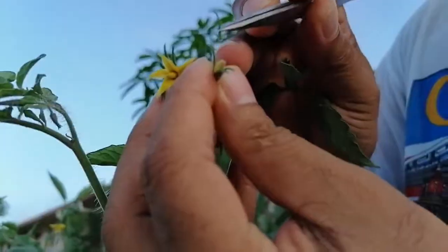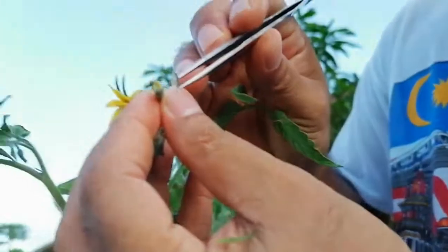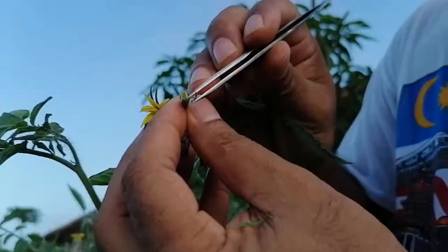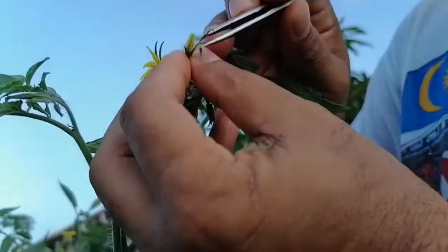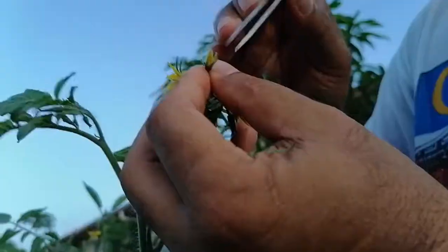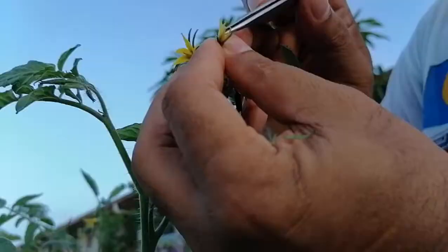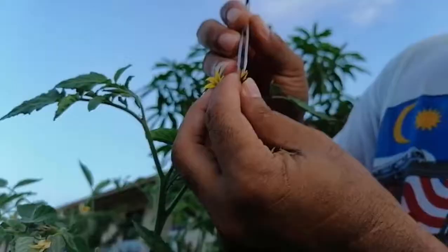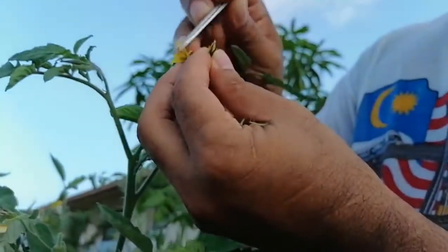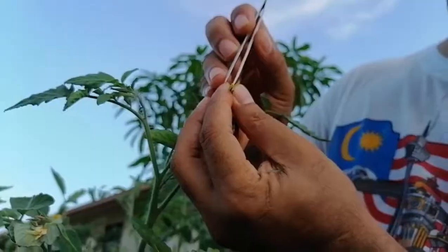First, we can remove the sepals — there are about five sepals — one by one, to make it easier for the emasculation job. After that you can see the unopened petals. We have to remove the petals as well.